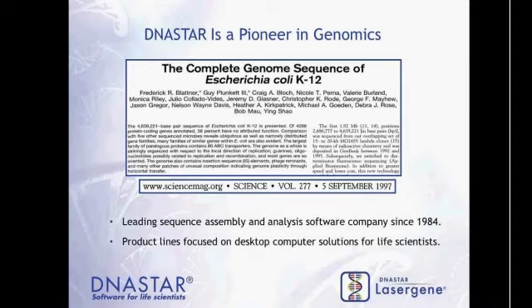So we've been in this business a long time, and we've always focused on developing software to meet the needs of molecular biologists, and really it's desktop software. So the idea is to make the software accessible to the researcher so they don't have to necessarily rely on a core facility or a bioinformatics team to do their analysis. So I'll be showing you software that can do both assembly and downstream analysis on a workflow.